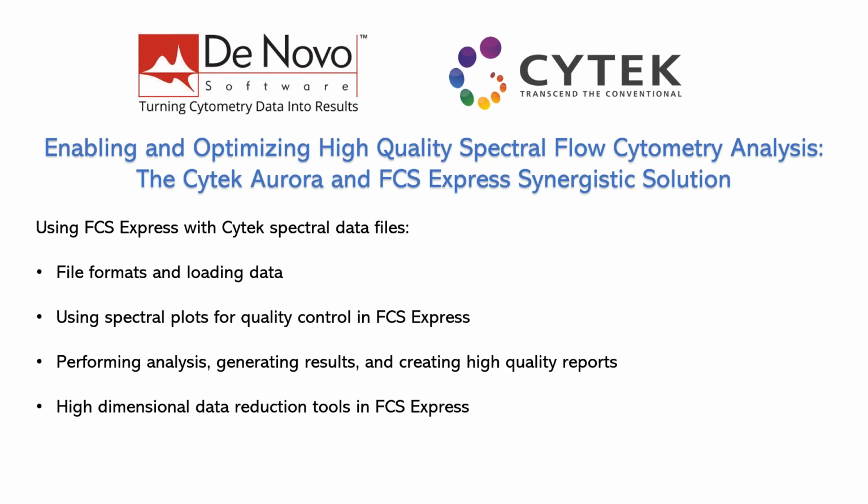First, we're going to cover some of the important concepts for the file formats and loading that data into FCS Express and how to work with our new spectrum plots. How we can use spectral plots for quality control in FCS Express. So kind of picking up where Janelle left off on a lot of the topics she covered about quality control, we're going to take a look at some of those workflows in FCS Express. And then we're going to come back around and pull it all together. And how do you perform an analysis? How do you generate results and create high quality reports from those results in FCS Express?